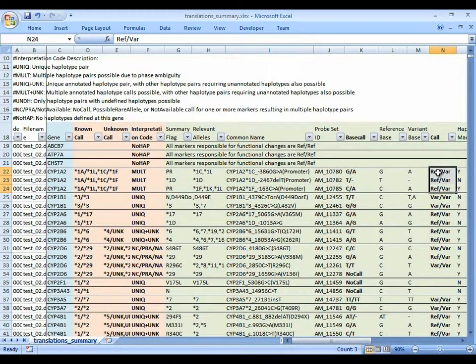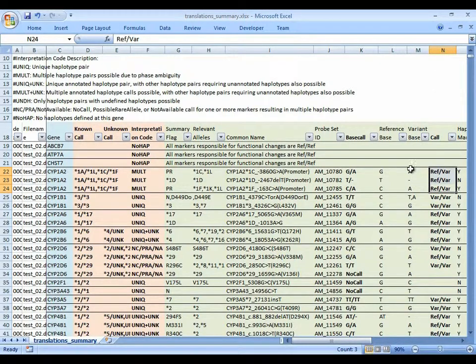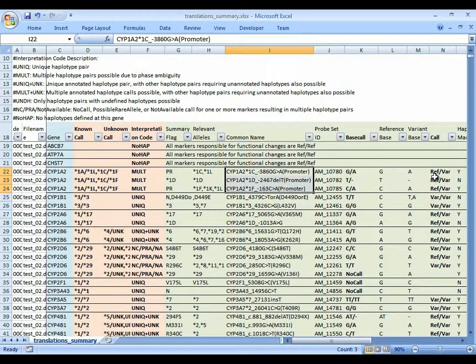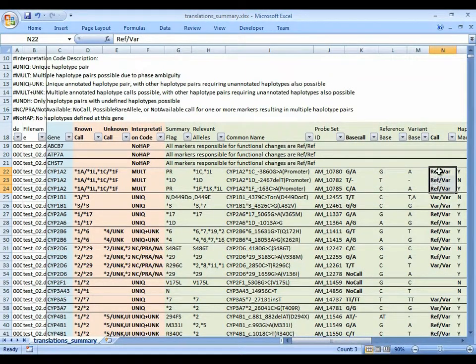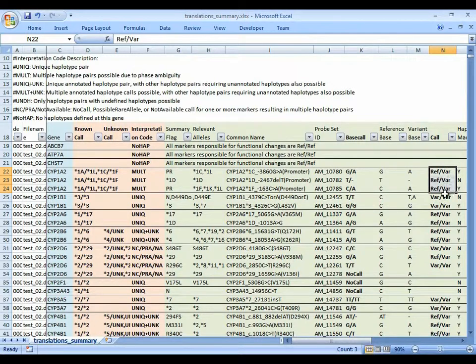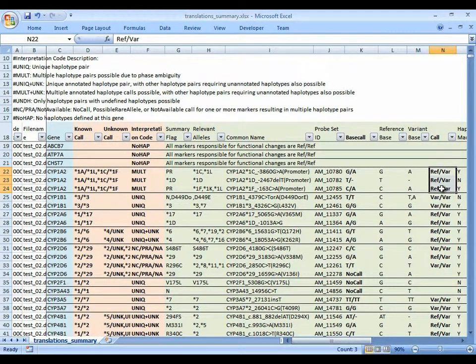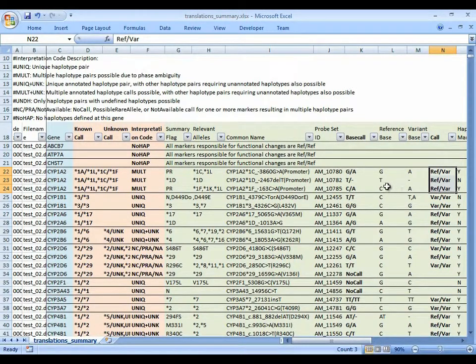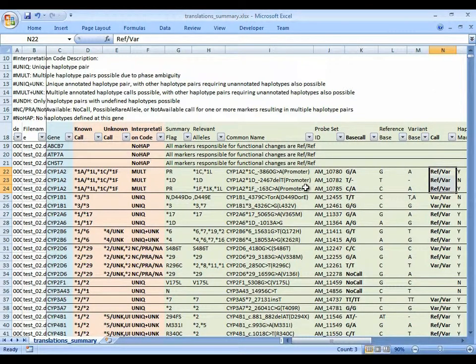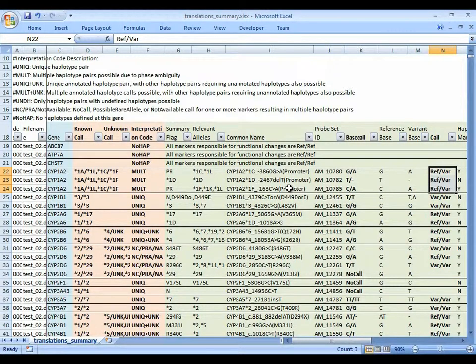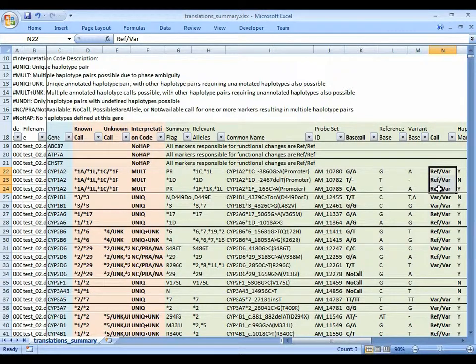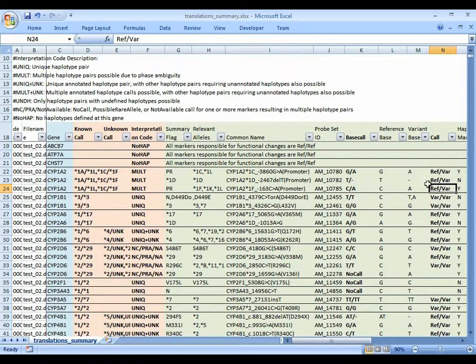The summary report, unlike the comprehensive report, doesn't list every single marker for every gene. It only lists the subset of markers that are either calling variant or have missing data. And it only calls the subset of those that, when they do call variant, have an impact on the form of the gene in the sense that they change the amino acid or that they affect the promoter or the expression level. So synonymous changes that don't change the amino acid, for example, those markers aren't reported, even if they change to a variant state. This is only in the summary report that I'm talking about.